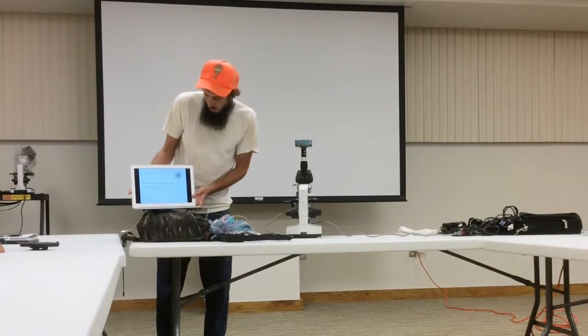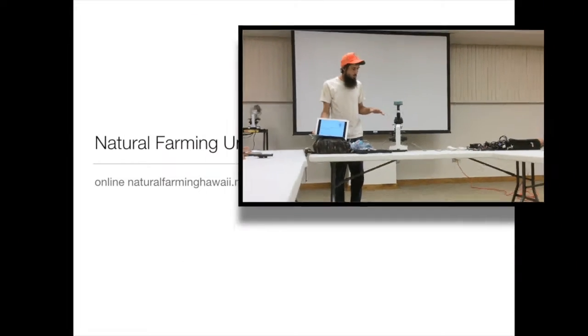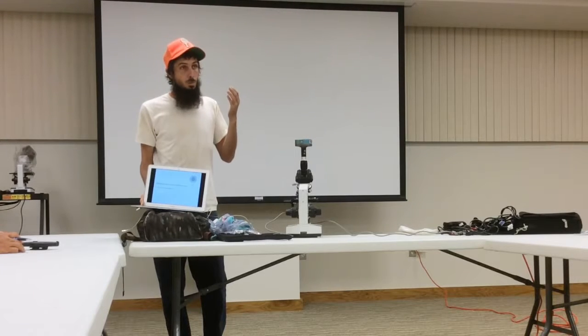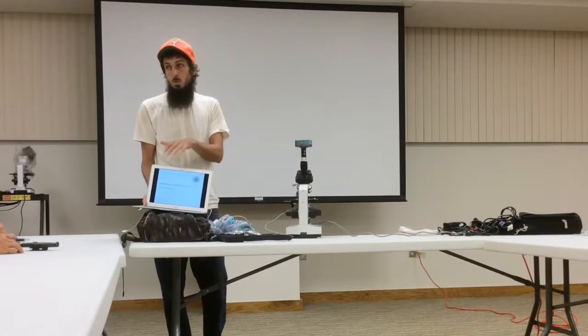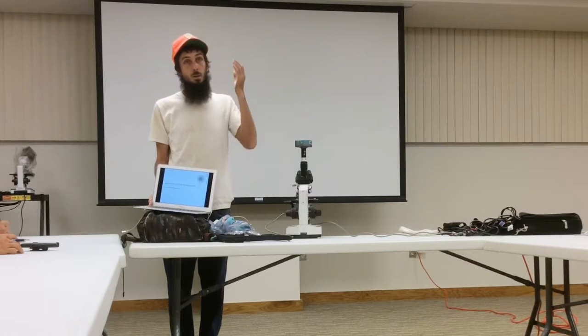So today, what I wanted to talk about here was the biology of natural farming, and explain a little bit of how I'm using the microscope to verify and validate the different things that we observe, like when you see the plant grow really well. I'm trying to use the microscope to make that correlation, where you can visually see and test what biology is making plants grow better.